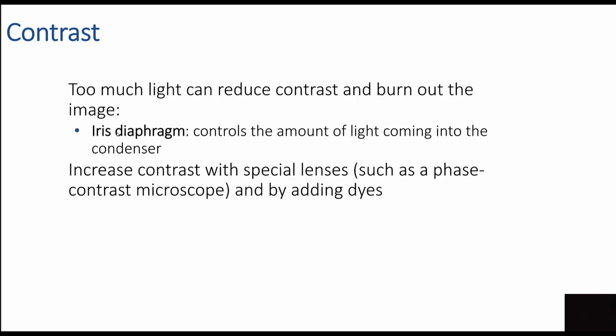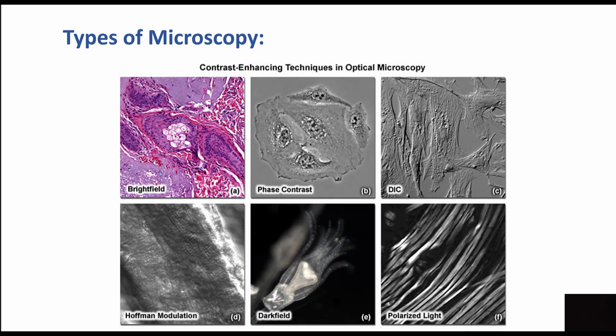We do want to use the iris diaphragm. We can adjust the contrast. It's sort of like the final adjustment for that, which is under the stage. Hopefully you won't need to.